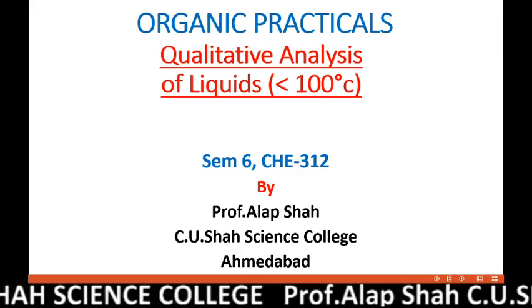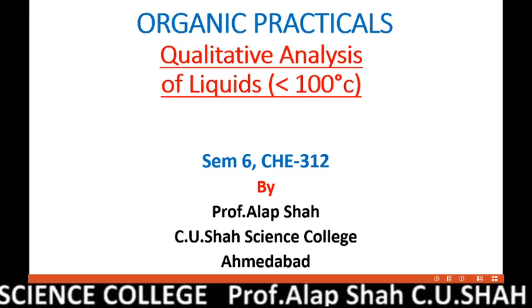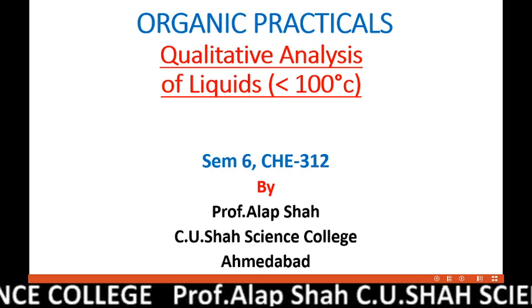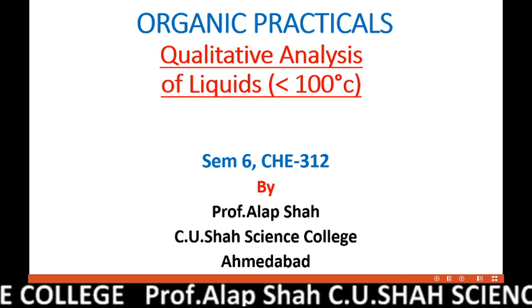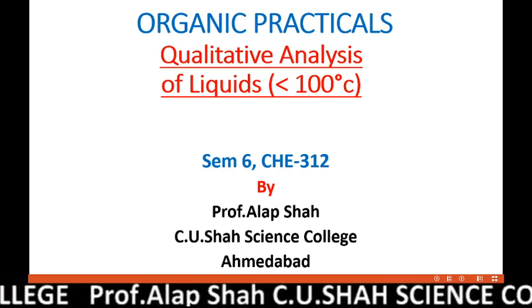In this video, we will discuss the qualitative analysis of organic liquids having boiling point lesser than 100 degrees Celsius, and this video is for the semester 6 students.